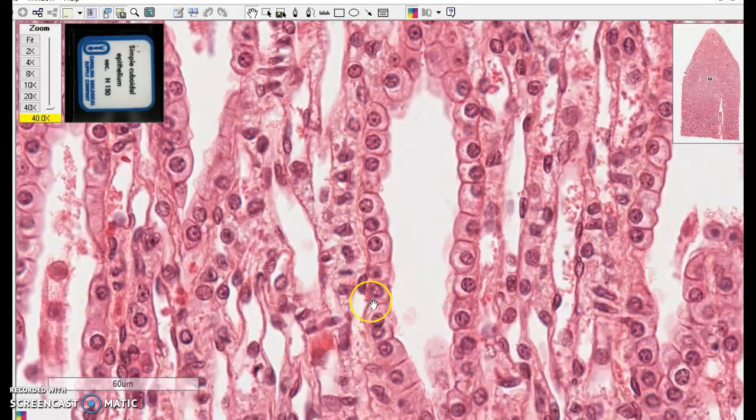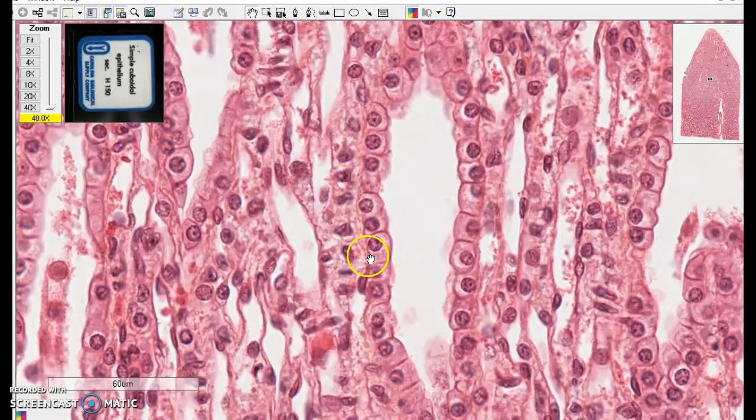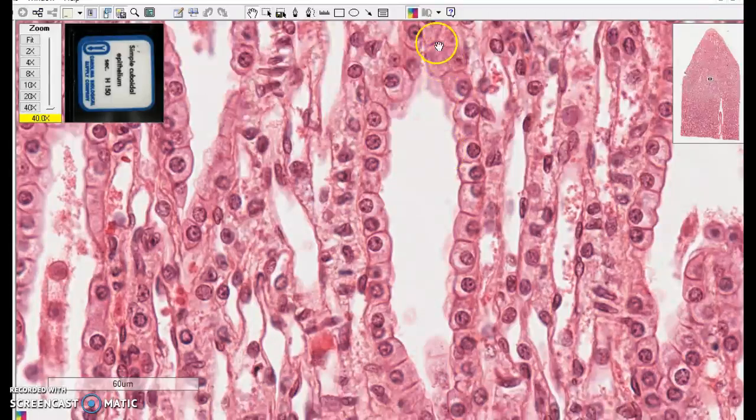So here is a single line. These are forming a tubule and this here is a simple cuboidal cell. Here's one, here's one. The basement membrane would be right along here. This is the inside of a tubule and there's a single layer of cells.